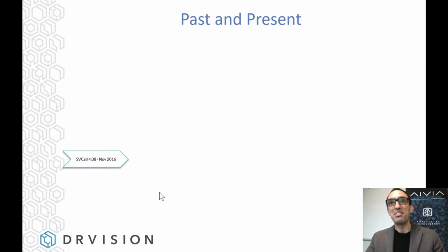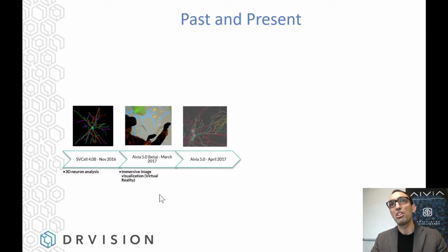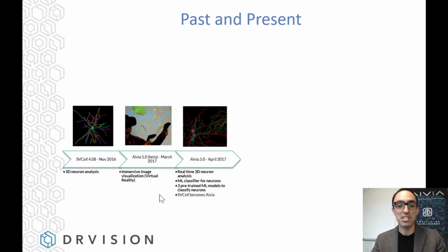So we have been active for the last year. Actually, DRVISION has been around for 18 years, and it has a lot of expertise in machine learning. But the Aivia tool that we are talking about today was really officially launched just in April 2017. And you will see how much we have developed it since.